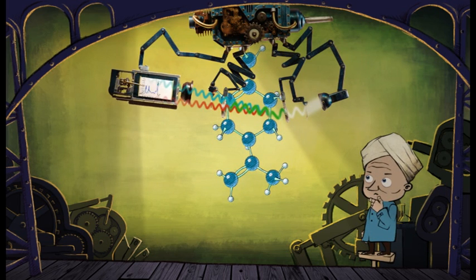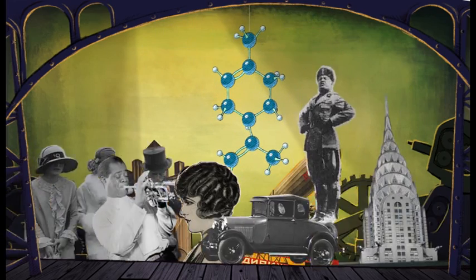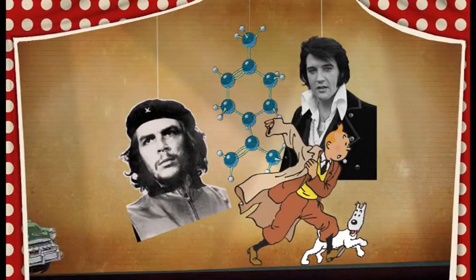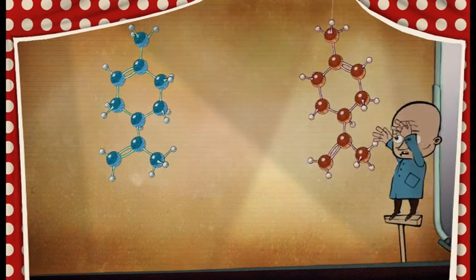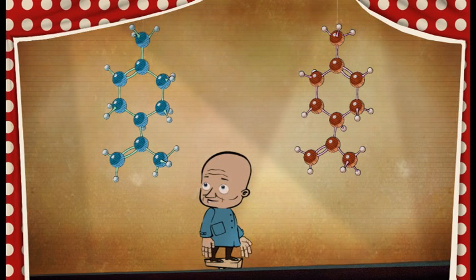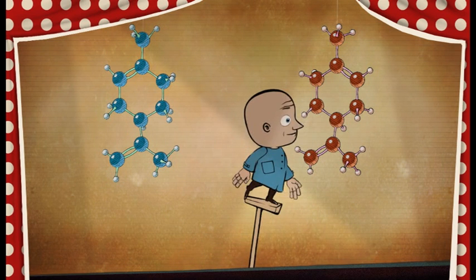Let us see what a Raman spectrum looks like for a molecule such as limonene. However, limonene, as most of the molecules in nature, exists in two enantiomers, mirror images of each other. One smells of citrus fruit, the other of turpentine.